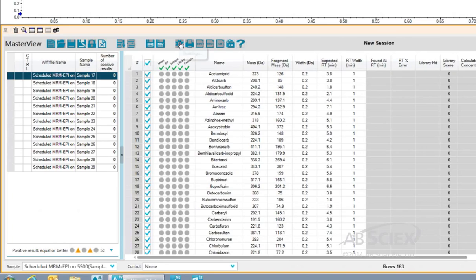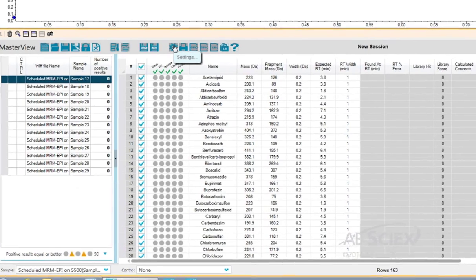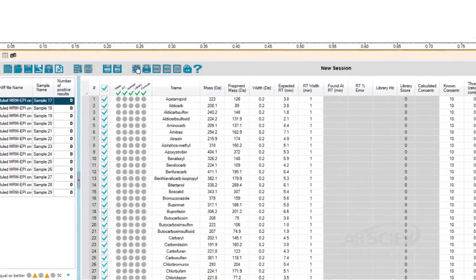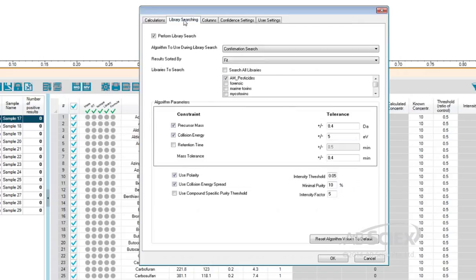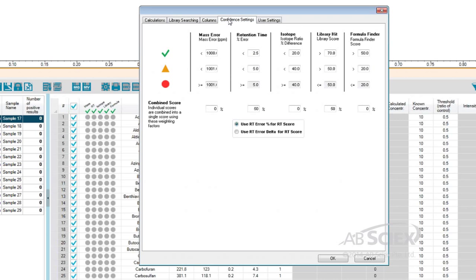Next, we'll open up the data processing settings. Here, we'll select the MS-MS compound library we want to use for the screen. In this case, we select our pesticide library, and we also check the confidence settings for the data processing.